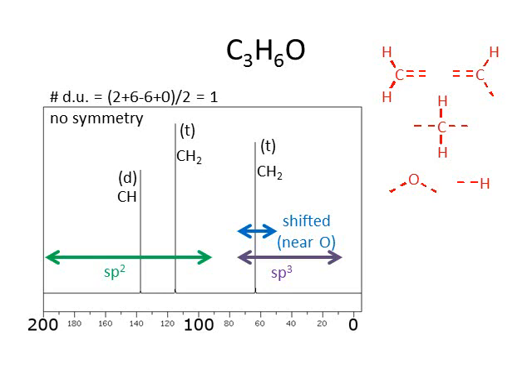Let's see how we can put these things together. Now, the first thing I notice is that these are sp2 hybridized. They're involved in double bonds. A double bond involves two sp2 hybridized atoms. Now, in this case, they must be double bonded to each other. Now, there is such a thing as a CO double bond, but that would come more like around 200. Plus, I need both of these carbons to be involved in double bonding. And so the only real explanation is that they're double bonded to each other.